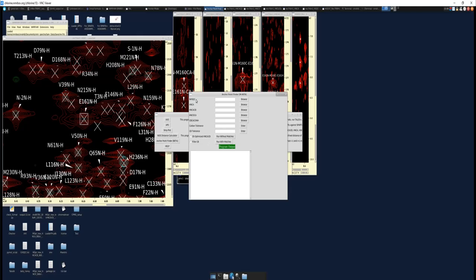What this tool does is look for and find amino acids, right? So these peaks here, that have both C alpha and C beta I-1s and I's, right? These are often really good starting points, right? Normally you look at alanines, serines, threonines, and glycines, and you try and use those as anchor points to do your sequential assignment. But once you've used all of them, which ones do you use now, right? Where do you start? And you want to start with data that you can create a string with, right?